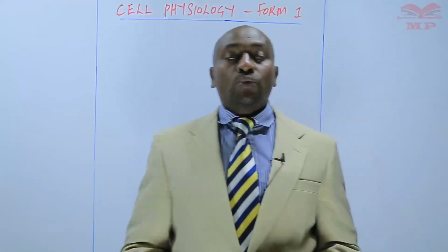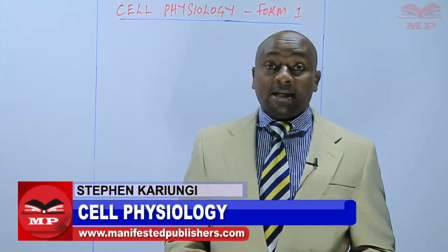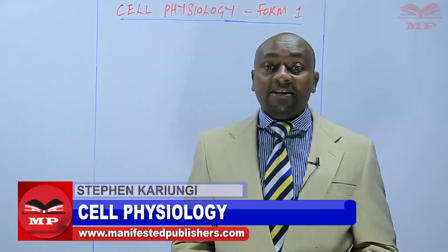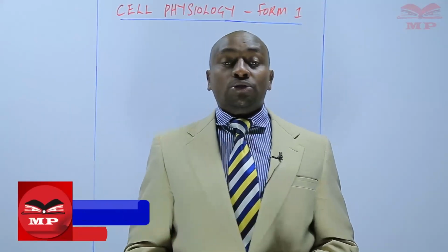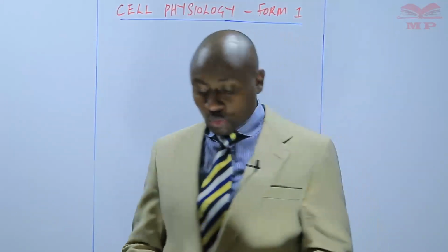Today we continue with our study on osmosis. Today I want us to have a different kind of experiment, and this is to demonstrate osmosis in a living tissue.